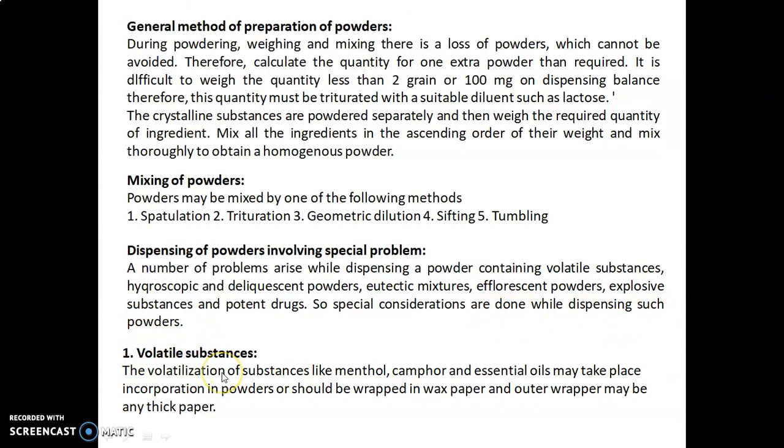Volatile substances. First problem is for the volatile substances. The volatilization of substances like menthol, camphor and the essential oils may take place.